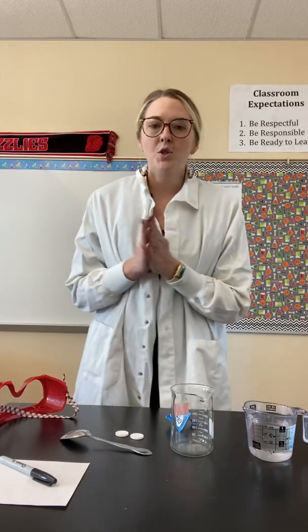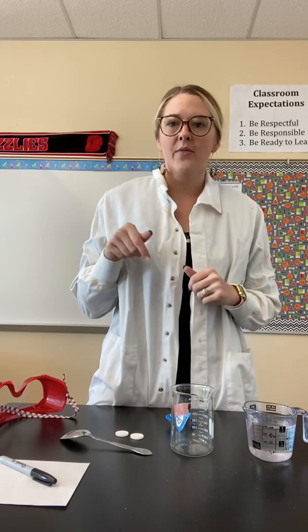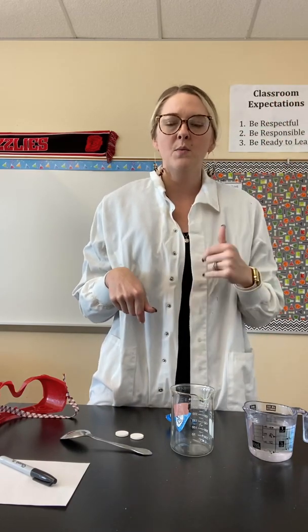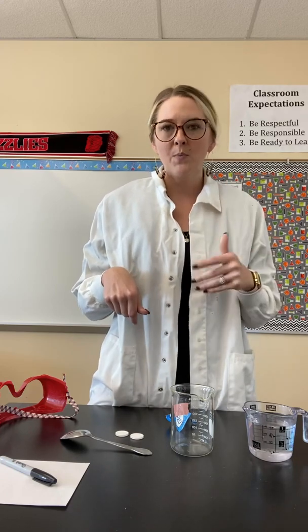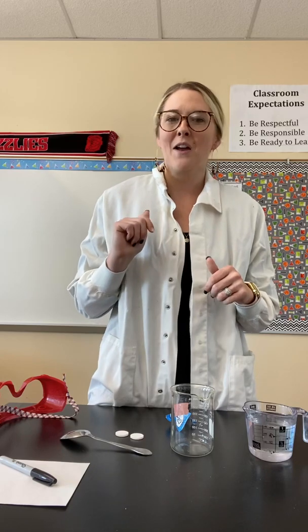So what I want you to do is right now, let's pause and let's take a look at the hypothesis. You should have read the background, what materials we need, and then the safety precautions that we're gonna take, and then go ahead and check out the hypothesis.